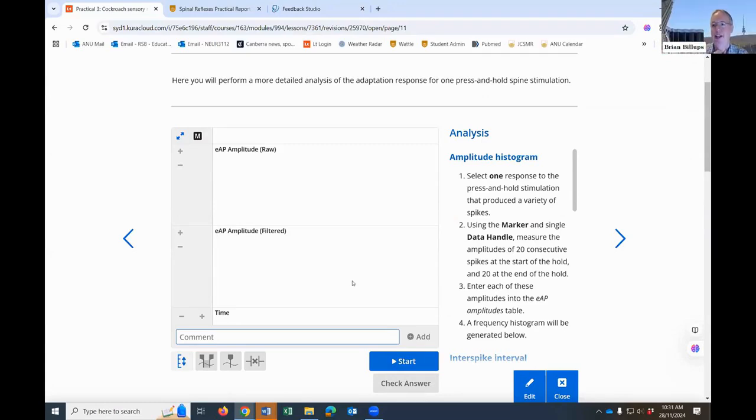We have 20-something workstations, and that's just because we have that many PowerLabs. They're all connected wired at the moment to the internet because they're all pushing data up to the cloud. So if you're going to run that with Wi-Fi, it's got to be a good Wi-Fi, because we're digitizing traces, so obviously that's pushing data up at quite a rate.